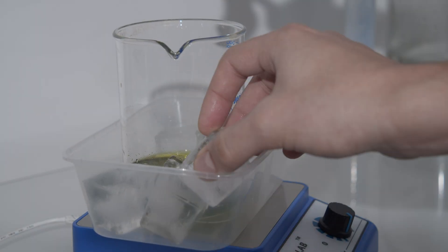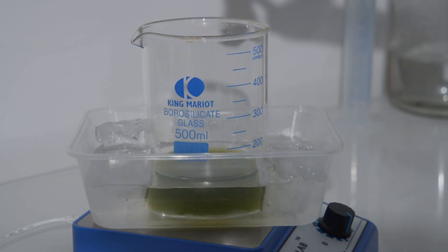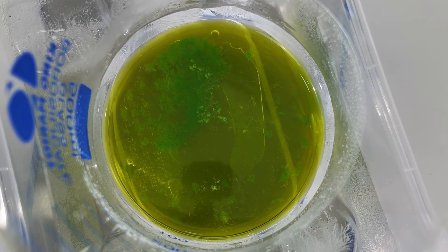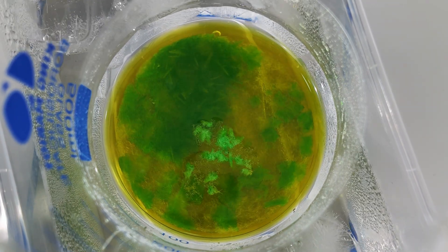Then I place the beaker into a plastic tray filled with ice water to cool it slowly. Beautiful green crystals of potassium ferroxalate began to appear.